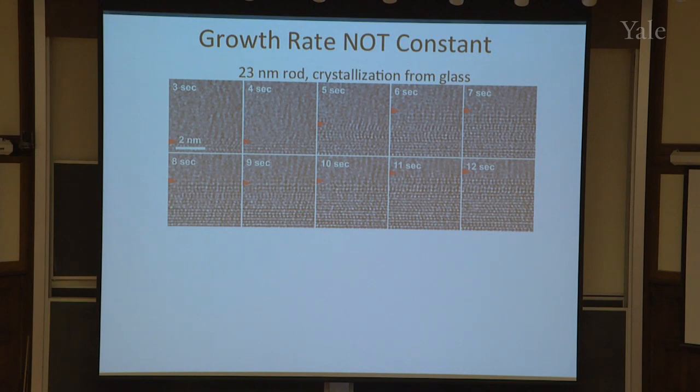Do you want me to tell you, or do you want to guess? Yes? I noticed that one section of each film simply does not crystallize, a thin section on the top. Oh, you mean here? Yeah. That's a very good question. It's because the crystalline region is at the bottom and it's moving upwards. So eventually, if I go to 15 seconds, 17 seconds, it's going to go all the way.